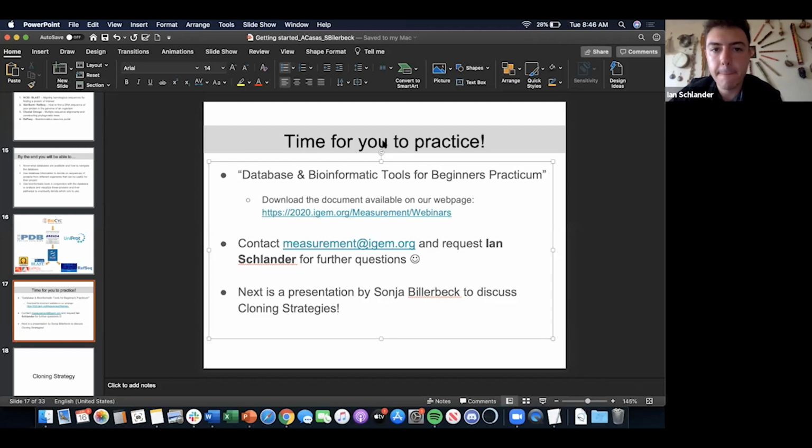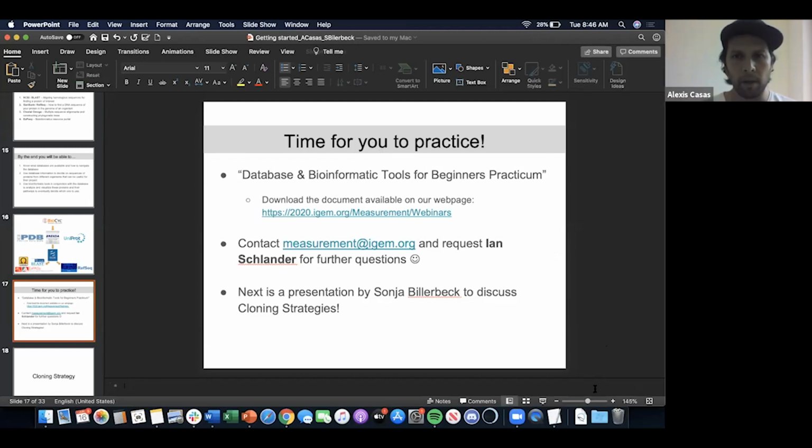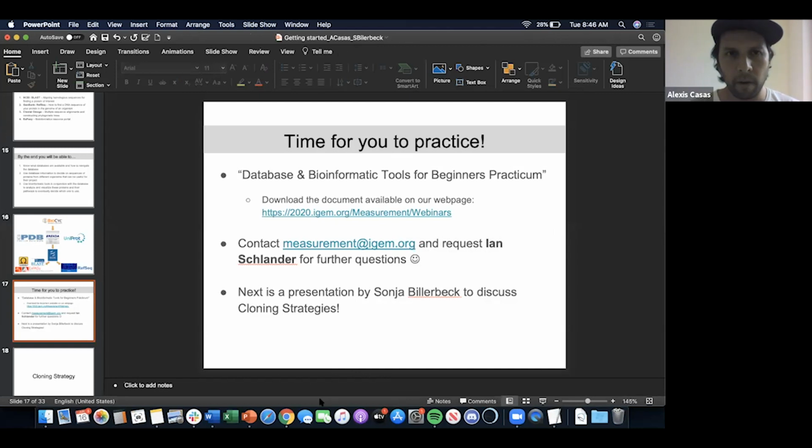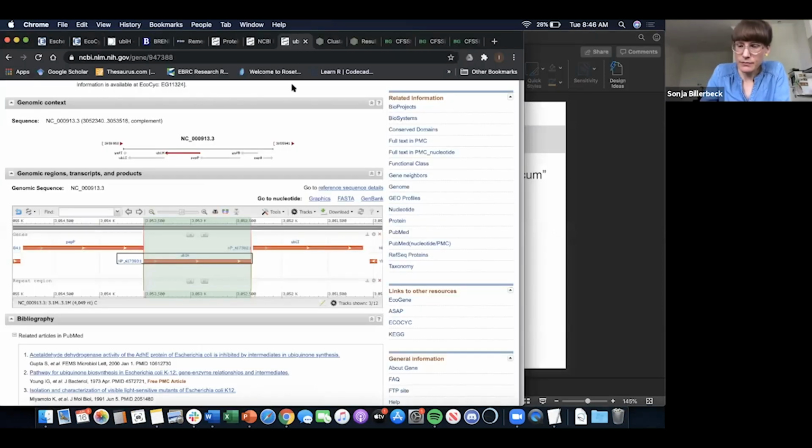So there's been a question for you about what the score is when you do a search in the different databases. I don't remember which one the question was asked on. So where would you see the score of your search? The score of my search. When you use BLAST. In BLAST. Yeah, the BLAST.